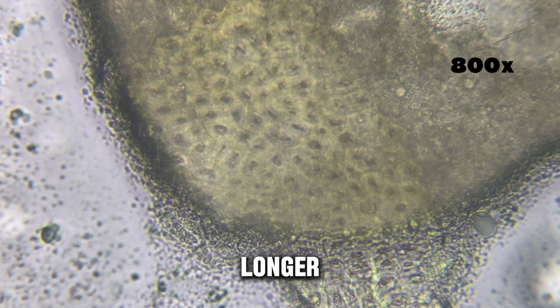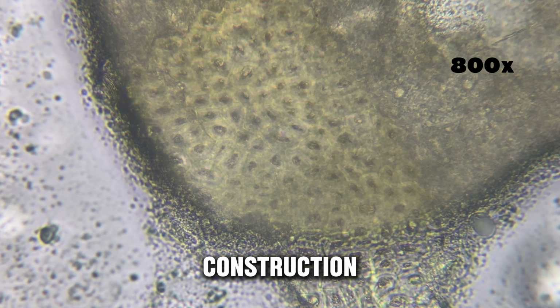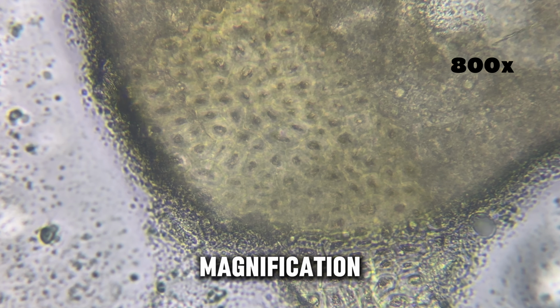The sauce no longer appears continuous at all. It looks fragmented and complex. At this scale, mustard no longer resembles food. It begins to look like a microscopic construction made from organic material. This magnification reveals how texture and thickness are built from countless small components.